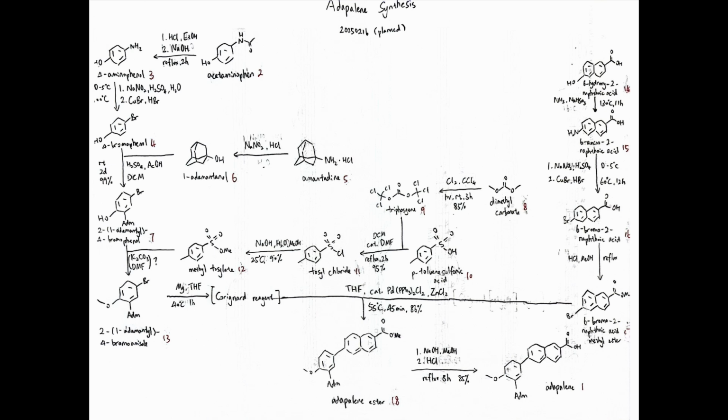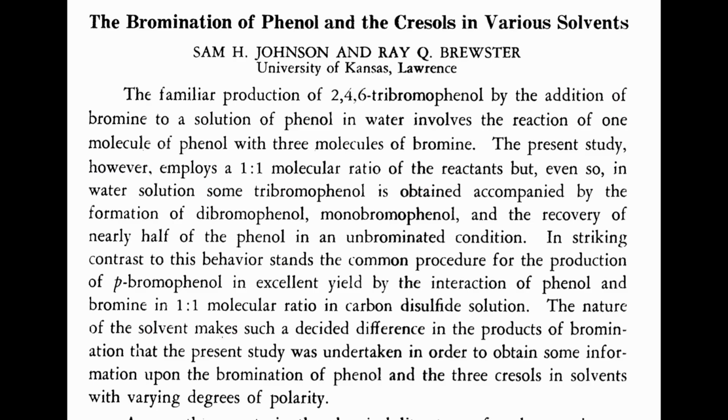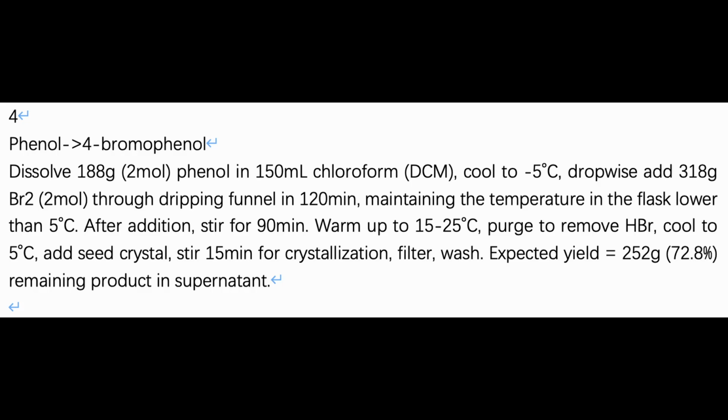Moreover, I realized that all of the precursors and reagents required in the synthesis can be obtained or otherwise made from domestic sources, so I designed this very large synthesis plan, starting from two common medications found in flu medicine, paracetamol and amantadine. Replicating this could be a future challenge for home chemists, but for now I'm just going to focus on the four steps that I mentioned to confirm that the method works and that my synthesis skills are qualified. But since 4-bromophenol appears to be easily prepared from phenol, I decided to make it myself. Of course, I still bought some 4-bromophenol from reagent companies to make sure that my remaining synthesis is going to work out. Anyways, let's get started.